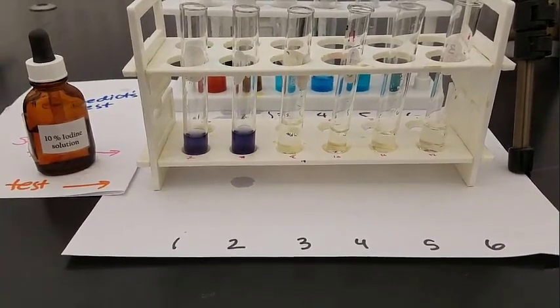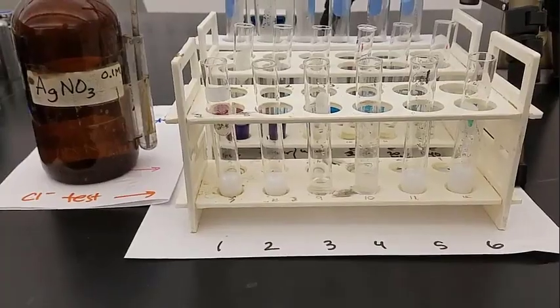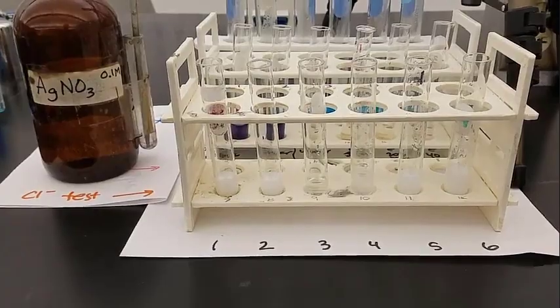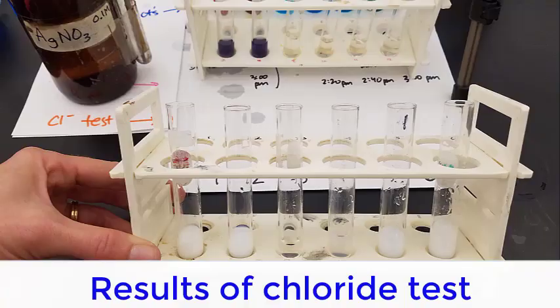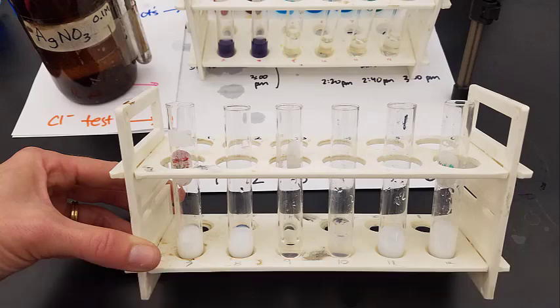Here is our final lineup of those Benedict's test precipitates. Quick glimpse of the starch test and the chloride test. We'll have longer glimpses in a minute. Now we'll see the results closer up. Remember, test tubes one and two are the blood, and three is water. We're looking at four, five, and six on the right to see if chloride is present.